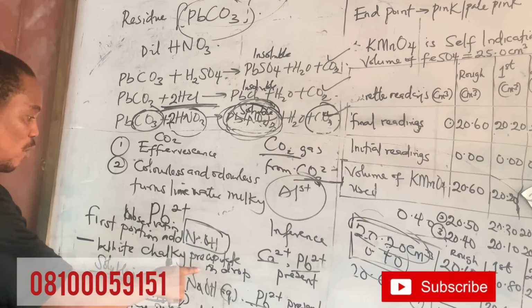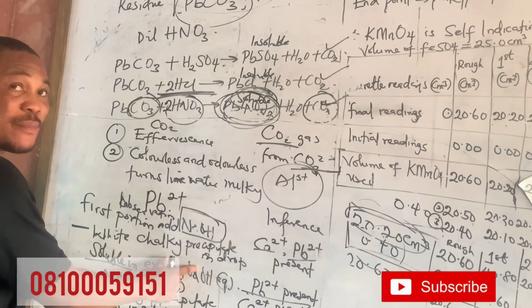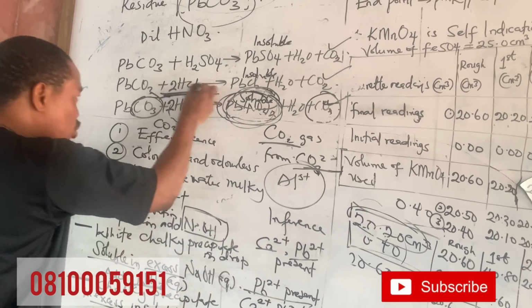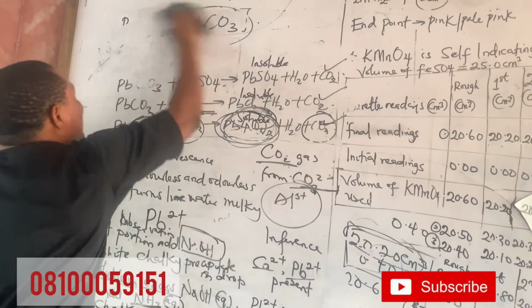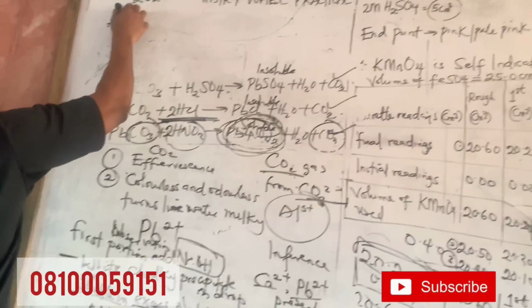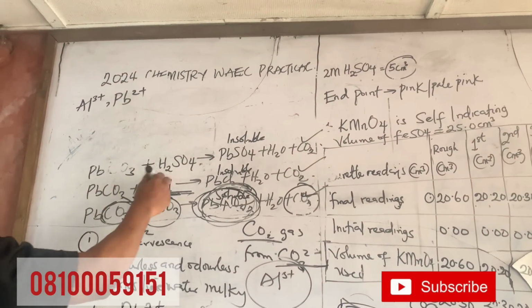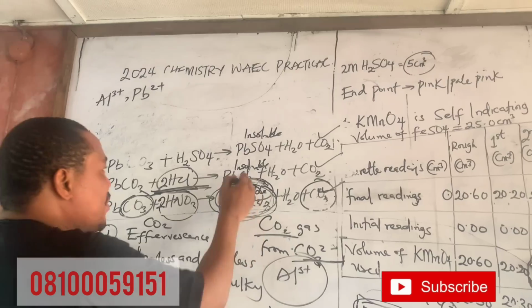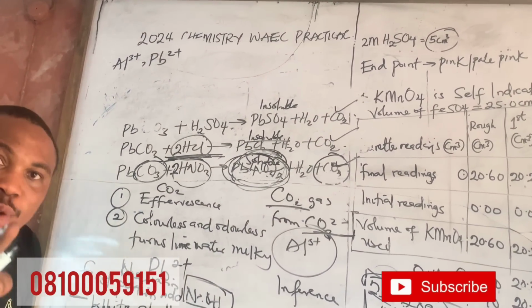The first one was, after we collected 3 samples from here, we added sodium hydroxide, we added ammonia. They can now ask you to add this HCl. Why did they tell you to add that HCl? The reason is because that's one of the things we use to differentiate this from actually this. So when you add this, have I not said that it will be an insoluble white precipitate? Now take note, which I am sure they will ask you.